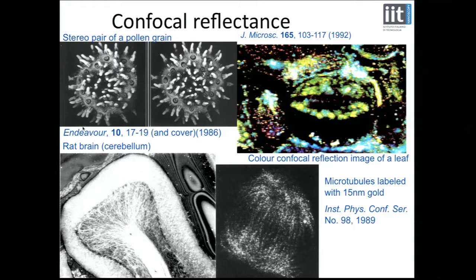This is a color confocal image. This is not pseudo color. This is taken using three lasers and three pinholes, and you have to, of course, align all that. So you have to get a research student, lock him in a lab for a week, and eventually he can get it all lined up.